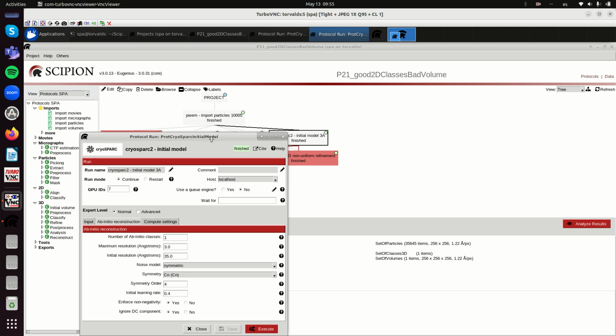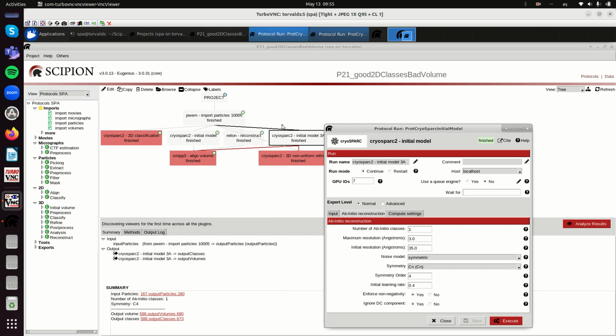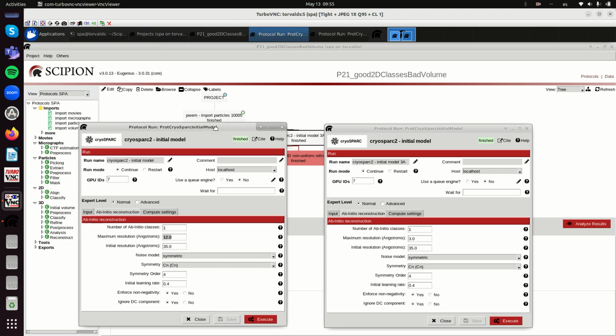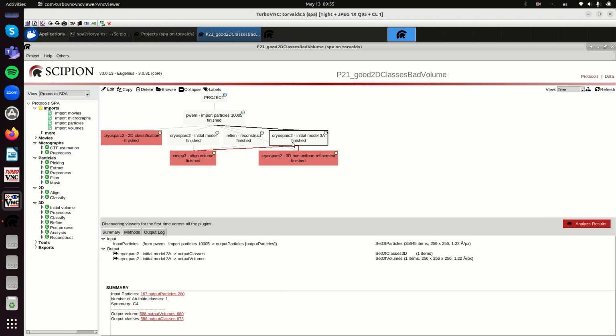If we think in terms of a landscape, what we are doing is adding much more noise to the data, so the landscape of solutions becomes more noisy and with many more local minima. First, it takes longer. This took 10 minutes. This took almost 4 hours, or more than 4 hours.